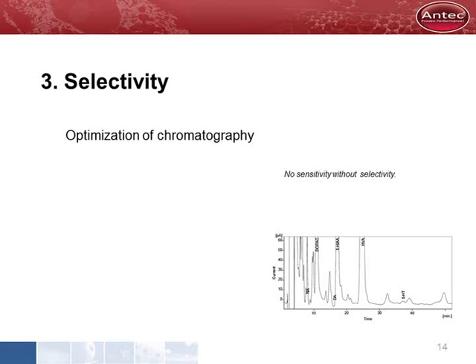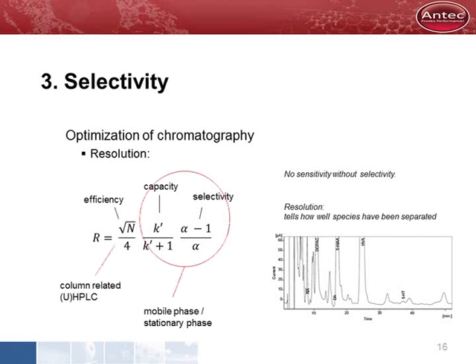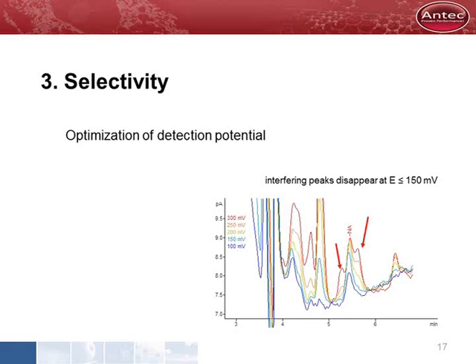Improved sensitivity is useless if peaks are not well separated. Separation of peaks is really important, and this can be difficult and time-consuming, especially in case of multi-component analysis. Resolution tells how well substances have been separated. The equation for resolution shows the parameters of importance. First, we select a column with sufficient efficiency and capacity, or retention. Next, we optimize the mobile phase to get our substances separated. Another way to improve selectivity is via the detection potential — when lowering the potential, the shouldering peaks disappear and the noradrenaline peak can be analyzed.